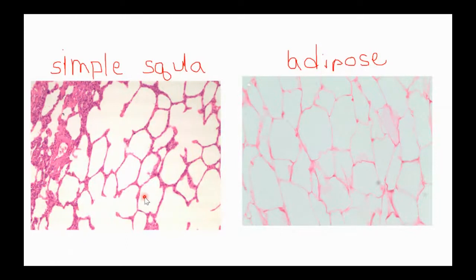Those open spaces are the places where there'd be air in your lungs. When we look at adipose tissue, some of my adipose tissue slides look like there's open space as well. If we're actually alive, if this tissue was not just on a slide, yeah, these cells would be completely filled with lipids. Hey, we need to know this for next week's exam.